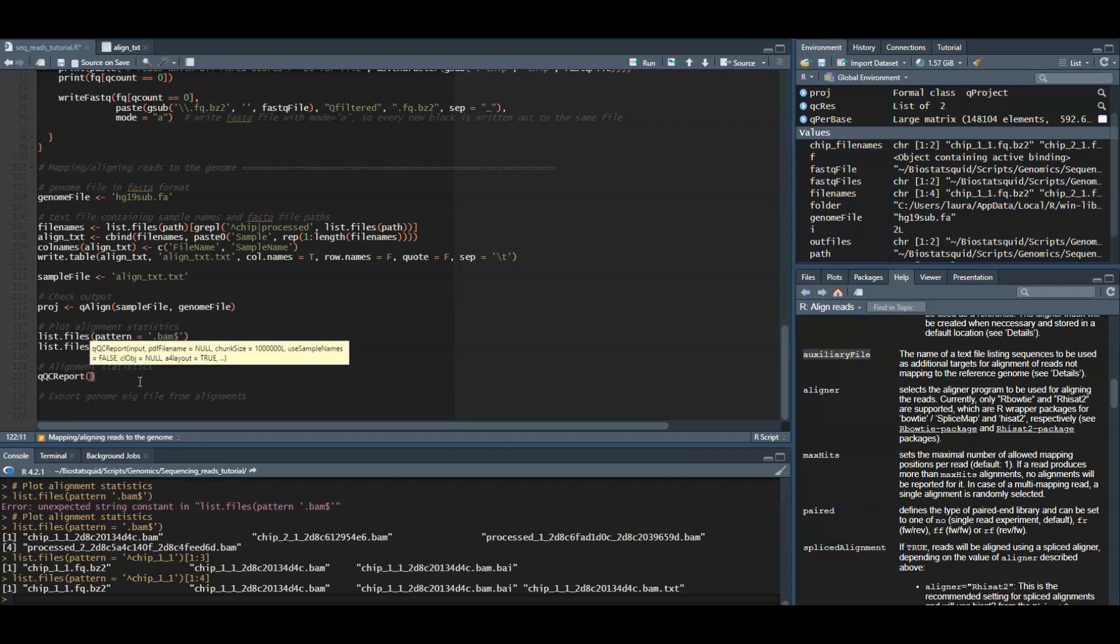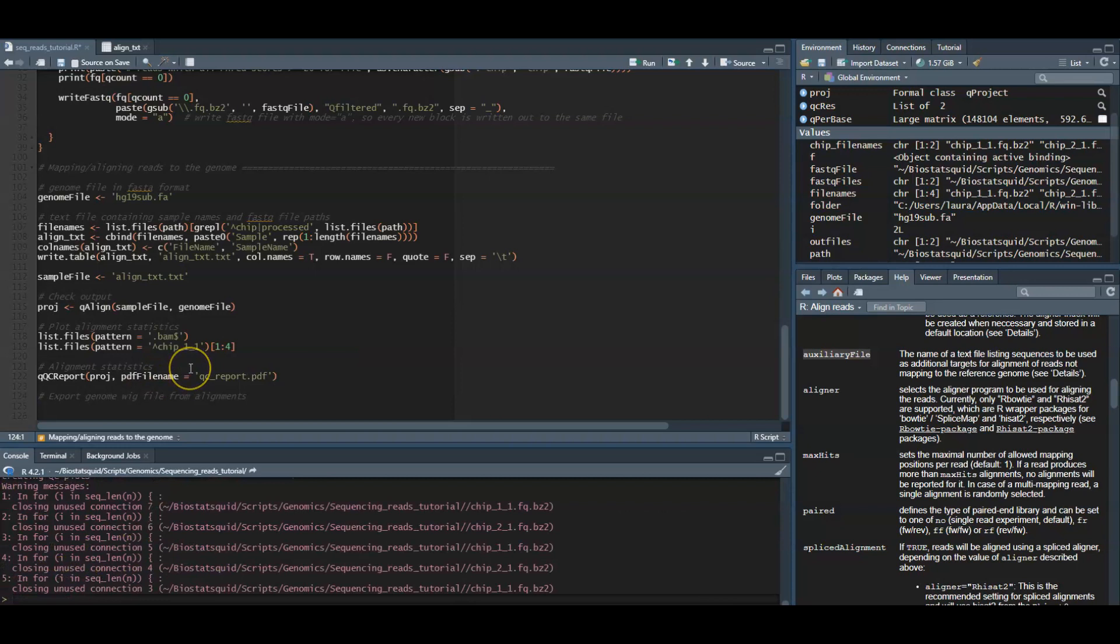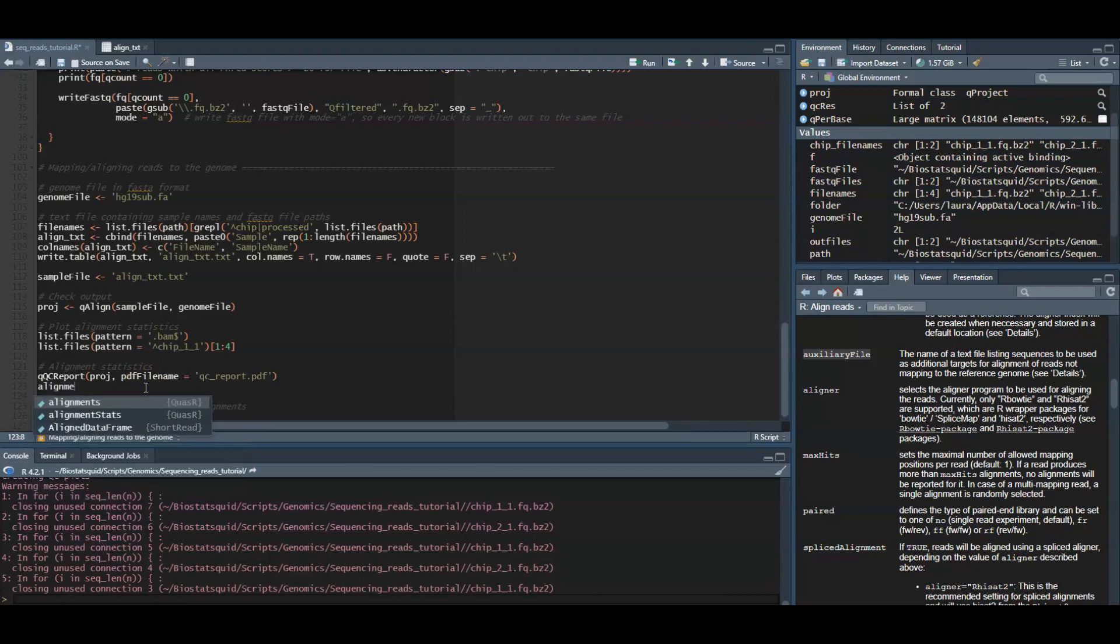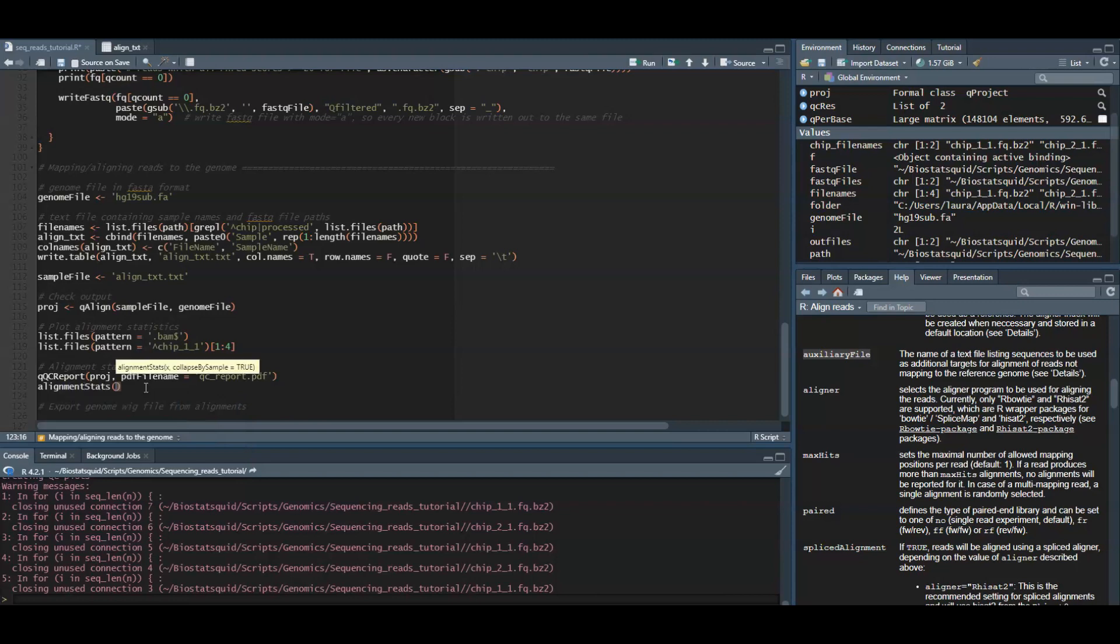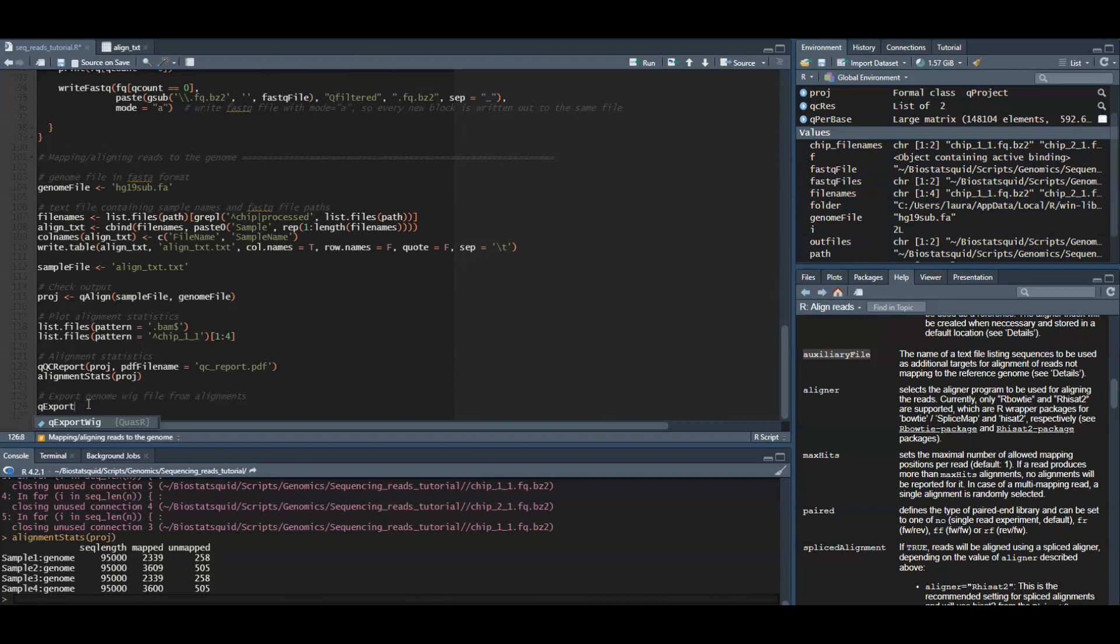If you want more information on file types, I can also make a video on that. Quasar can produce a quality control report in the form of a series of diagnostic plots with details on sequences and alignments with this function qQCReport, which will export a PDF. Then the alignmentStats gets the number of mapped and unmapped reads for each sequence file in the qproject object.